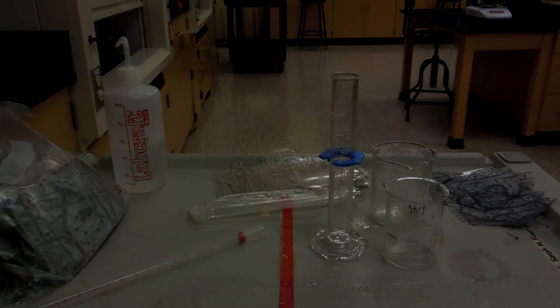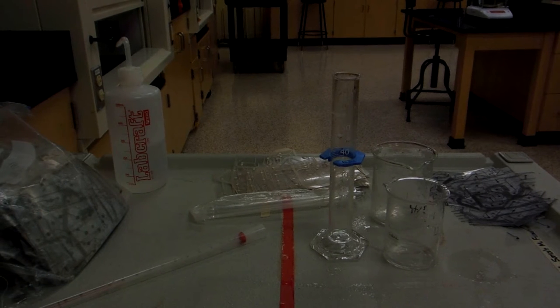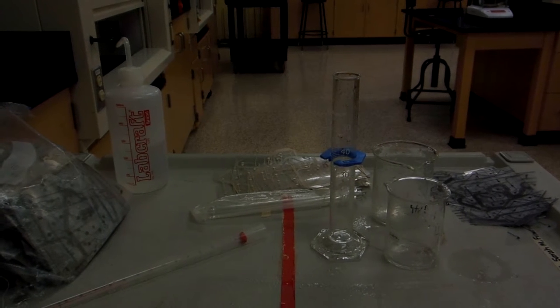Some black Teflon tweezers for picking up and holding onto the Mylar. Some acid resistant or nitrile gloves are necessary. A lab apron is needed. And goggles are also nice to have when working under a fume hood.